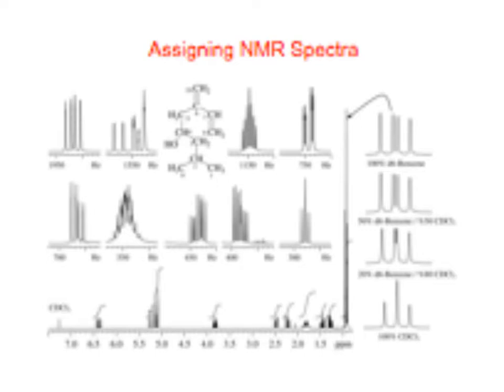So in chloroform, it looks like a triplet right here. And then they started adding some deuterated benzene into the solvent, and look at that, there were two doublets that split apart. The triplet doesn't look equivalent if you look at it.